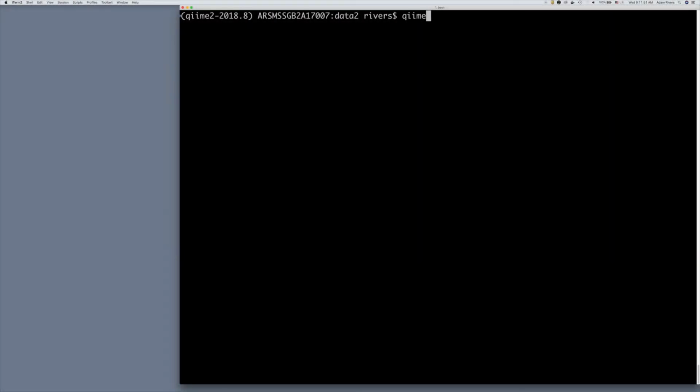That software from Callahan et al. is pretty effective. There's other software built into QIIME 2 called Deblur. I would recommend using DADA2 at this point because Deblur requires single-ended reads, and it requires them to be uniform length, and the ITS region is pretty variable in length, so that has some limitations. At this point, we're ready to move on to calling sequence variants.